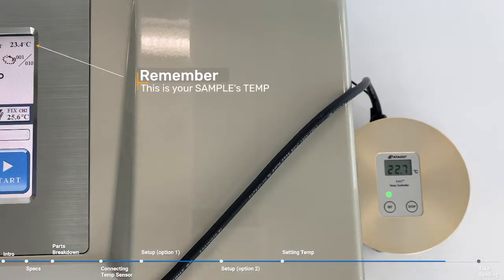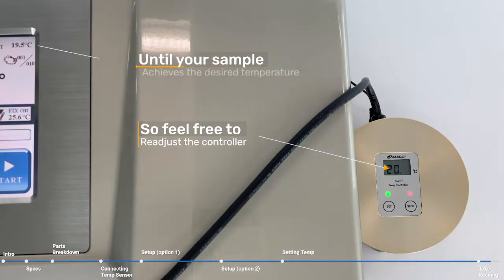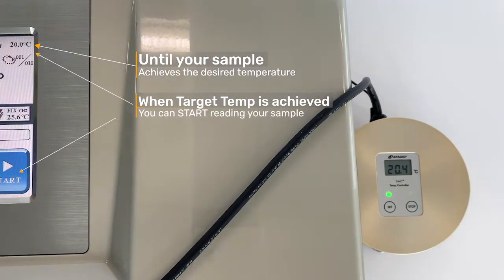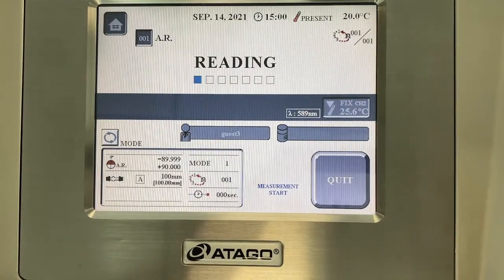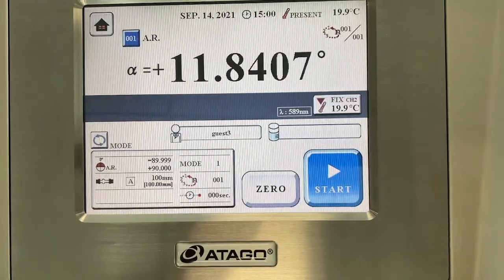You can see how quickly it goes from 25 to 20 Celsius. I have programmed this one for 19.8, was it? So that the sample to the left of the screen hits 20. Sorry, I had put it at 20, but the sample only read 19.5, so I changed it, and now it hits 20. Then it's ready to take a reading, just like the regular polarimeter. You press start, it takes a reading. And that's it.